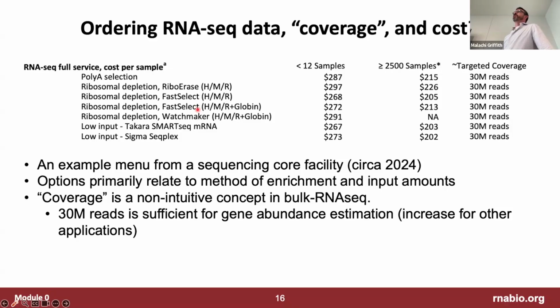So the question is if you have enough samples to fill 3 flow cells. If you're working on the most recent instruments, I would say congratulations, you're doing a very big experiment, because that would actually be a huge amount of data generation. But say you're doing that, or say you're using one of the older platforms that had smaller flow cells. Do you need to include a control, like include one sample on all 3 flow cells to control for variability across the flow cells?